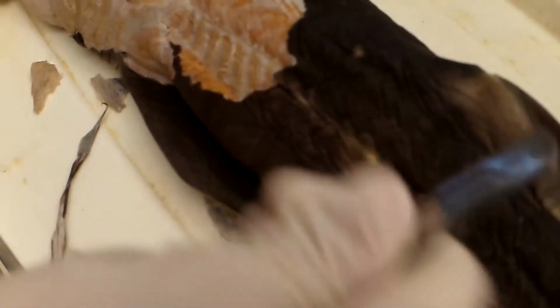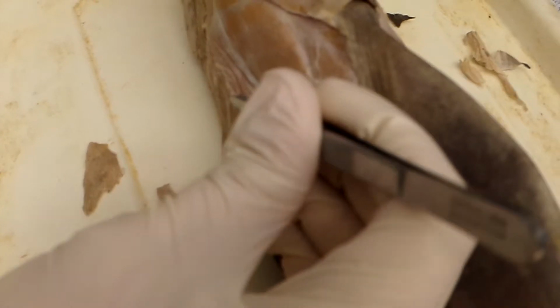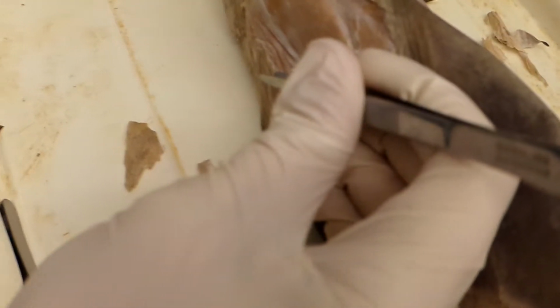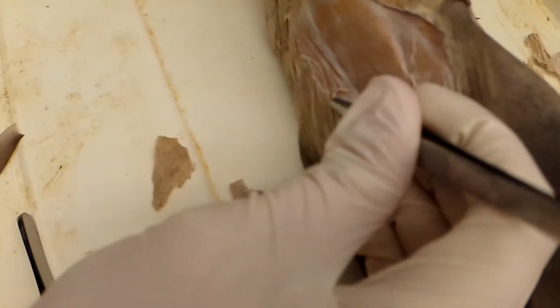Then we have the hypaxial muscles on the ventral side of the shark, which are deep to these muscles here, and they originate in the vertebral column and insert in the integument and are homologous to the rectus abdominis, the external obliques, the internal obliques, and the transversus.